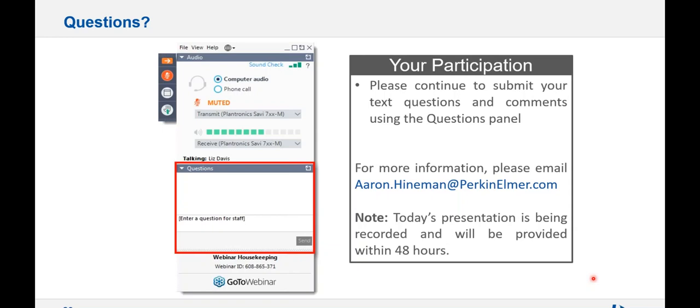Sarah, do you have a quick answer for that? I mean, you just leave it the default. As far as I know, I've never changed the BOC time. The instrument knows when to start the BOC reading, but I've never changed the time.